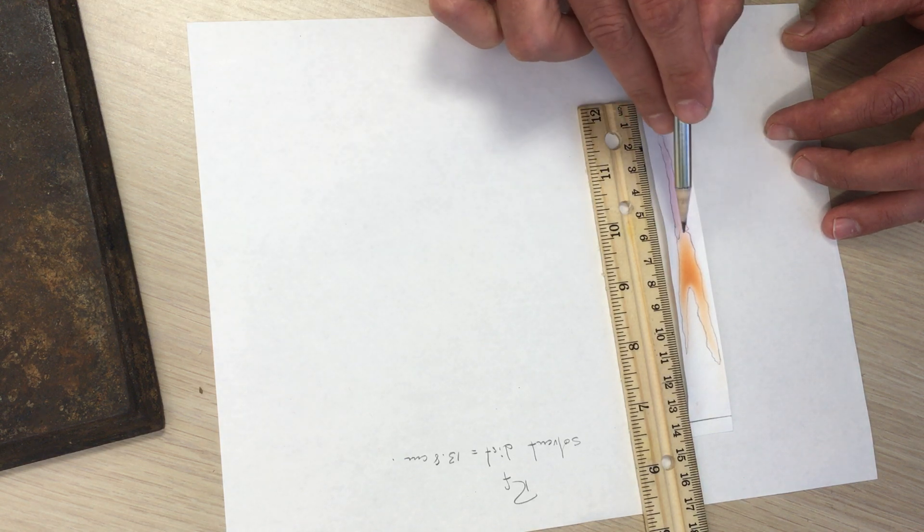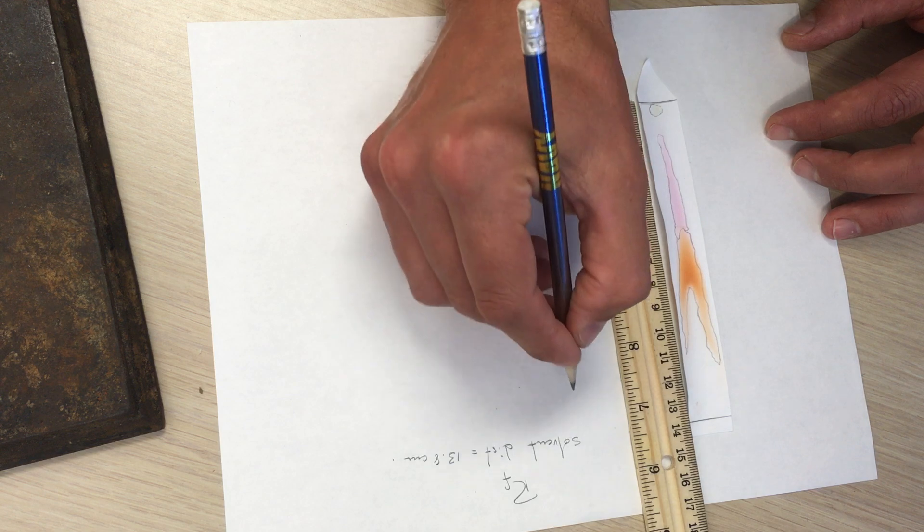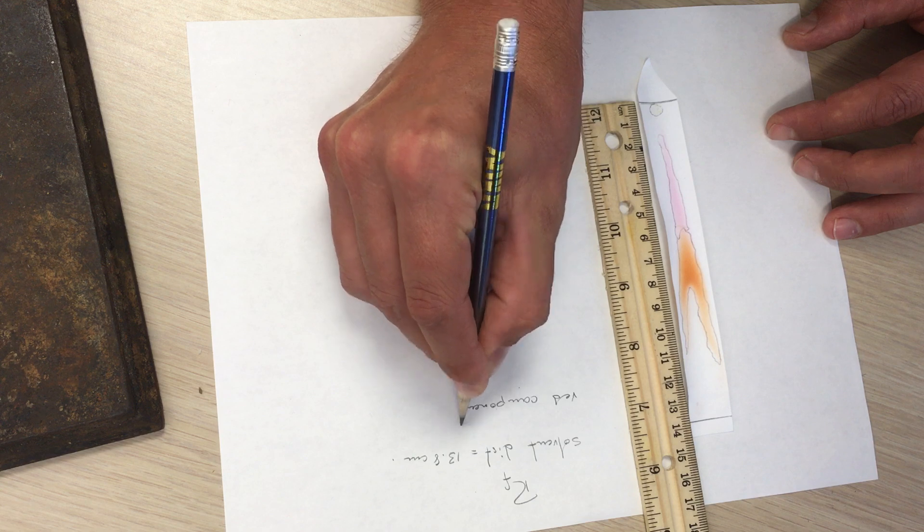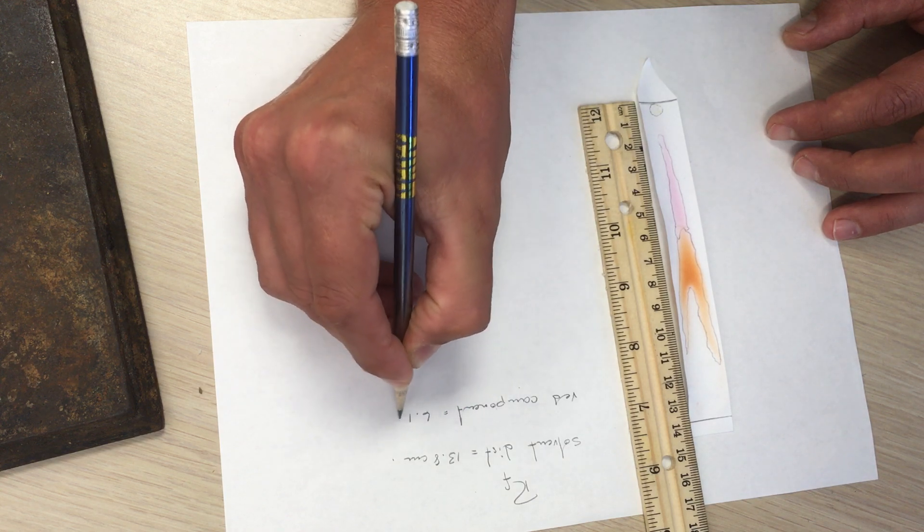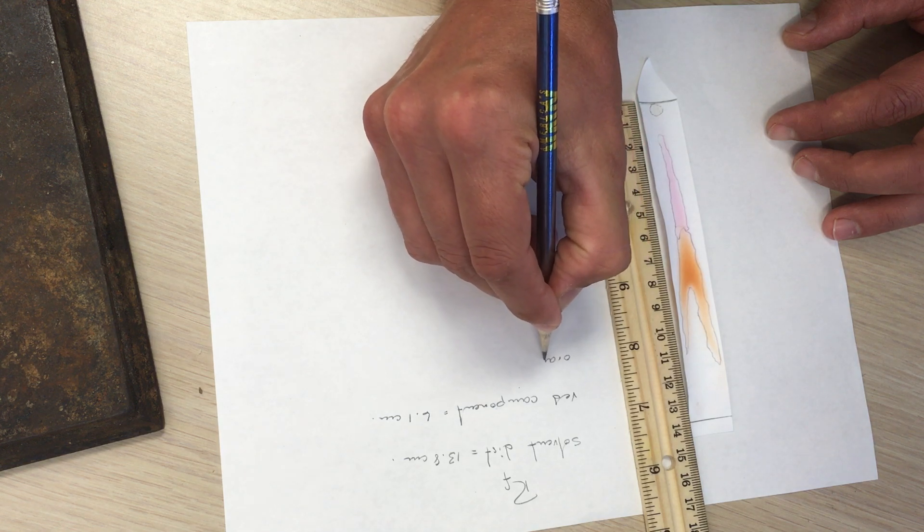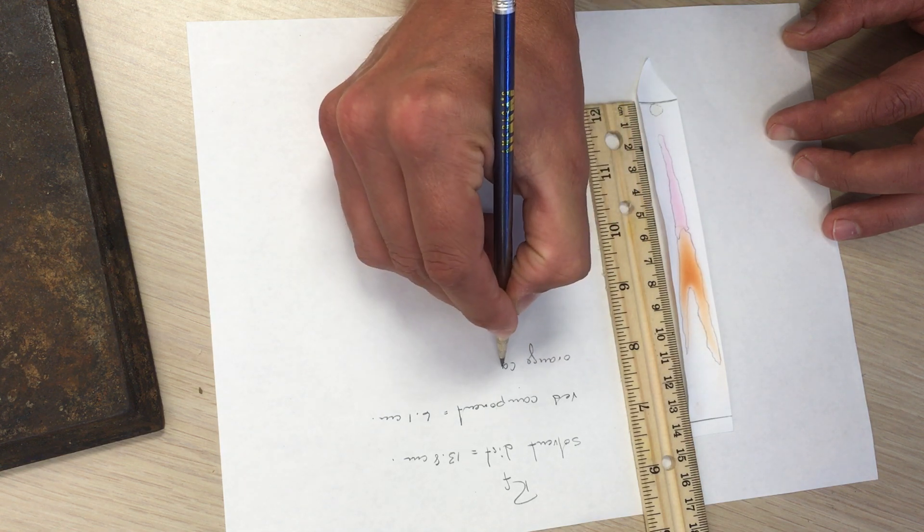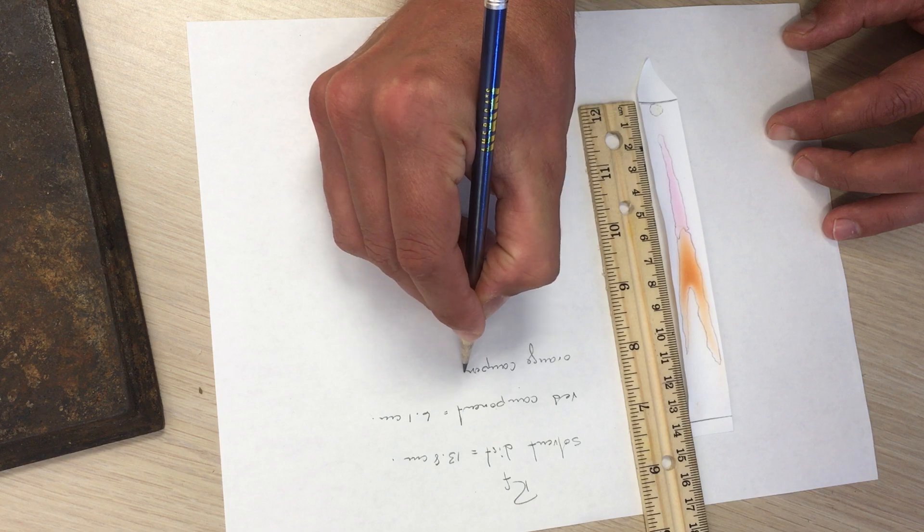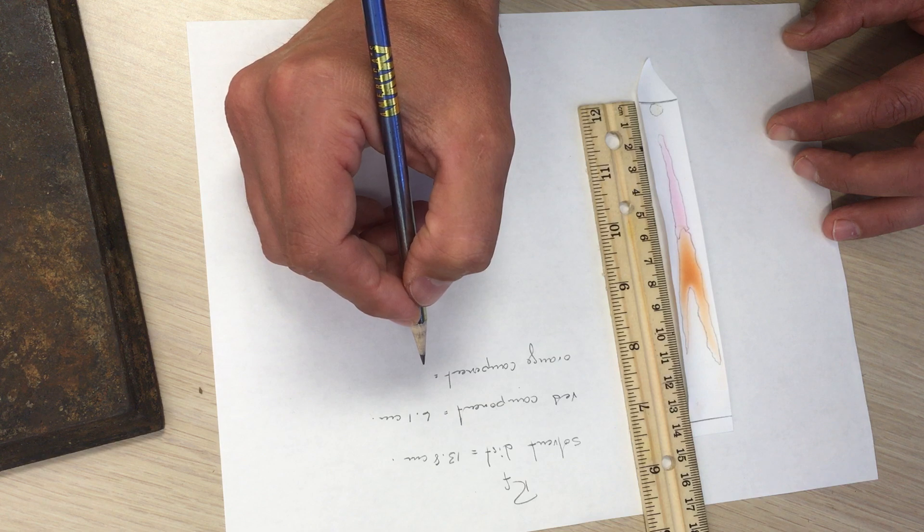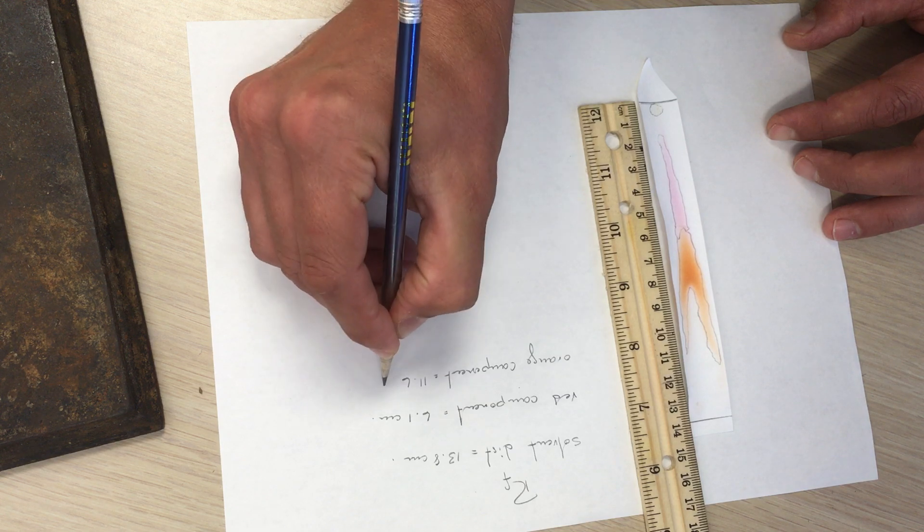So there's a red component that traveled to about 6.1 centimeters and the orange component to about 11.6 centimeters.